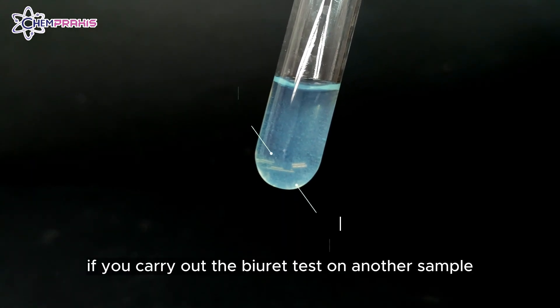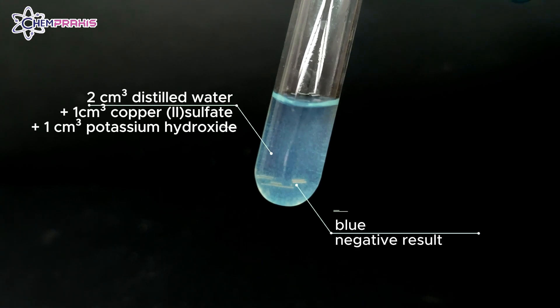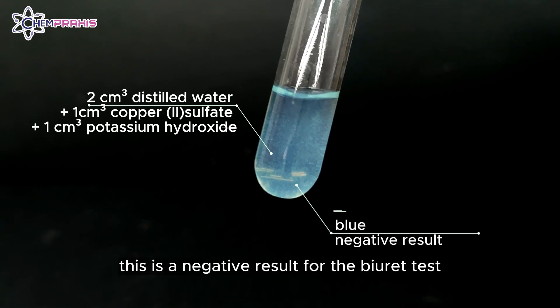If we carry out the biuret test on another sample that does not contain protein, the solution will turn blue. This is a negative result for the biuret test.